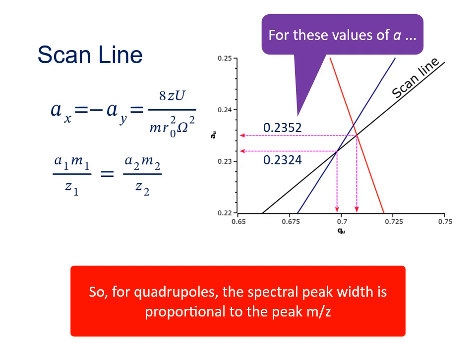And yes, the resolution, that's the mass divided by the delta mass, is constant across the spectrum, but the peak width is not. It gets larger with mass. So whilst you might be able to see the isotopic peaks fully resolved for low mass ions, beyond a certain mass you won't be able to see that anymore. And if you go high enough up in mass, all the isotopic peaks will blend into a single distribution.